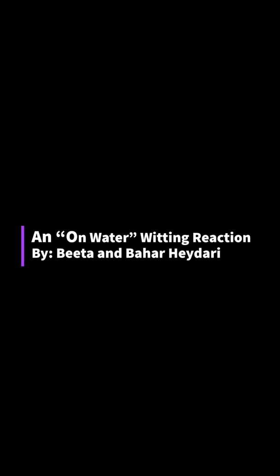Hi everyone! Sabohar and I are going to show you guys how to do the Wittig lab, which is the last lab of the semester.